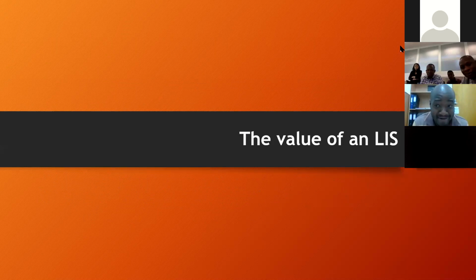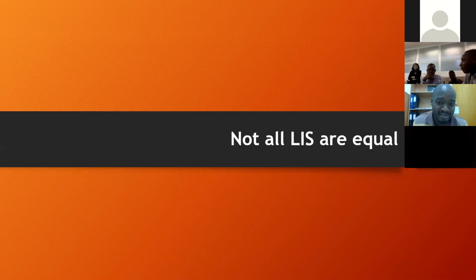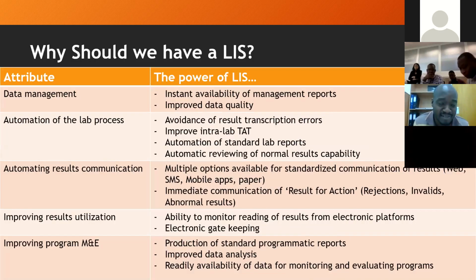Right, slide number 6. Apologies for the interruption. So moving on to the reason. We defined an LIS as a software-based application that is used in a laboratory to manage workflow, and there's also data exchange that is involved. So we now want to look at why we should actually have an LIS.